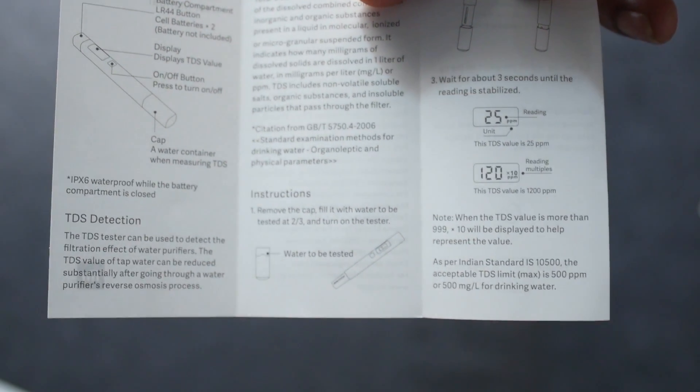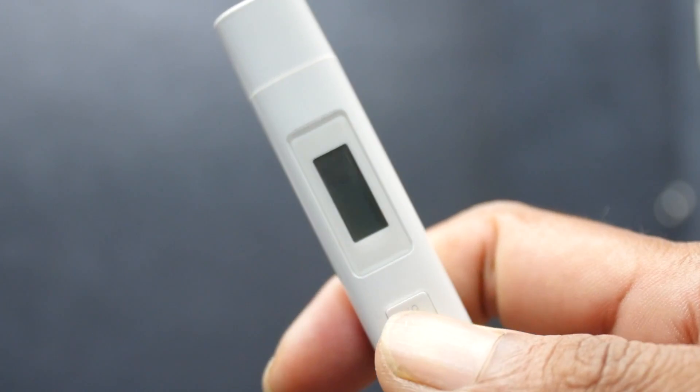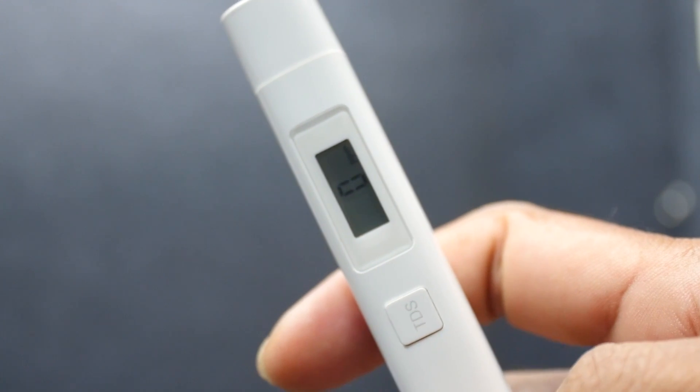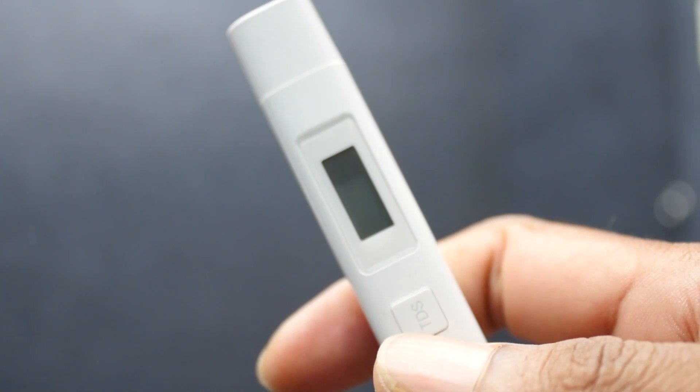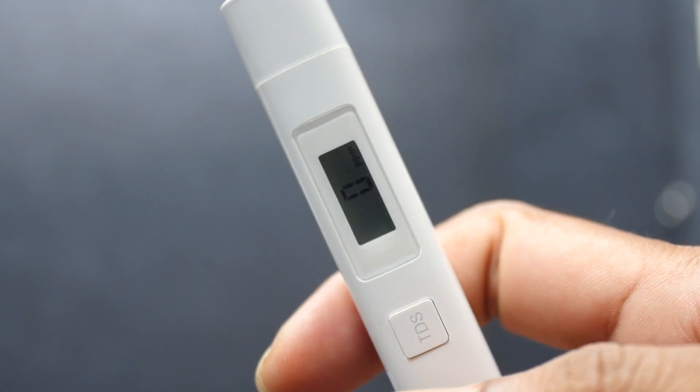On the side of the PPM reading, there are symbols indicating the unit. One of the pros of this TDS meter is the hold button. By pressing and holding the button while it is in the water, you can lock the value on the display and read it easily.